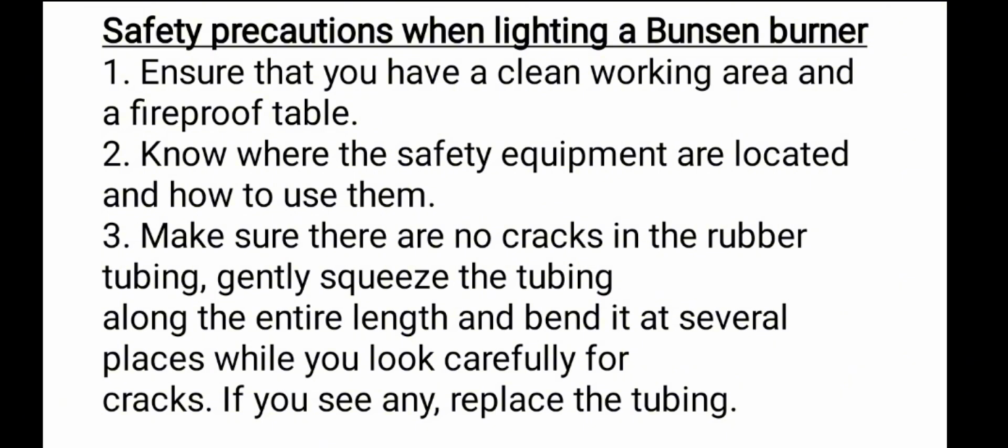The third is make sure there are no cracks in the rubber tube or the rubber tubing. What you have to do is gently squeeze the rubber along the entire length and bend it at several places while you look carefully for cracks. If you see any, replace the tubing.